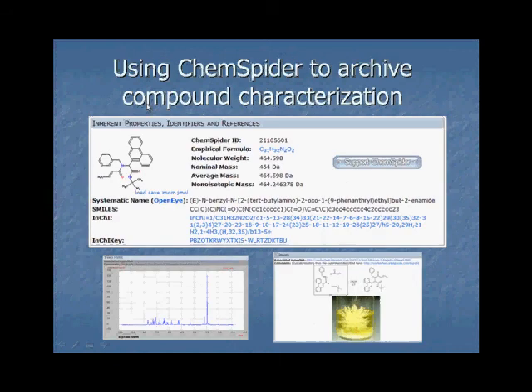And as you saw Tony talk about, we've also been using ChemSpider to archive characterized compounds. The difference here is that these are spectra that I approved of. These are final isolated compounds. But of course, in research, you take monitoring runs, you take impure compounds, you're in the process of purification. So all of those NMRs and spectra have to be accounted for as well. Right now, we're only using ChemSpider to store the best stuff, the stuff that we would send to a paper.